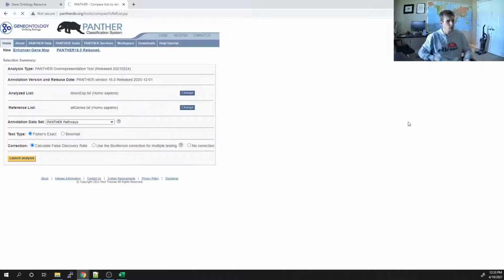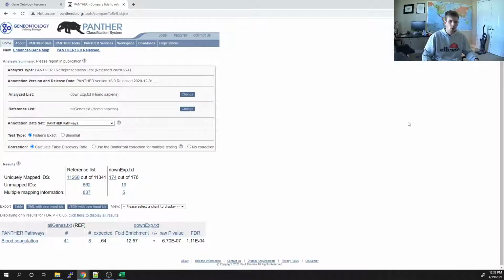Not super bioinformatic-y, but this is definitely going down a rabbit hole. You definitely have to spend a lot of time going down this annotation GO thing. Yeah, blood coagulation. So that could be a problem for turtles. If they're sitting in salt water for a little too long, they may not be as good at healing themselves as they should be because these genes are affected. That seems to be one of the responses.